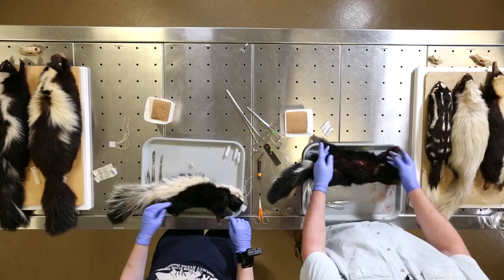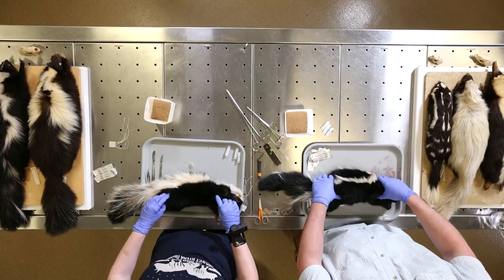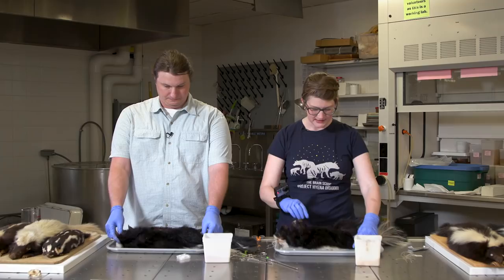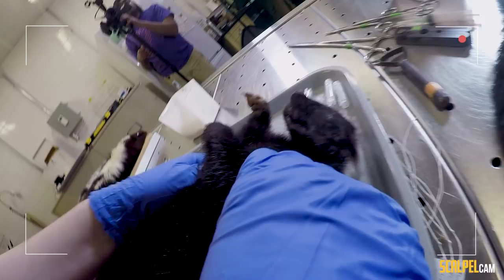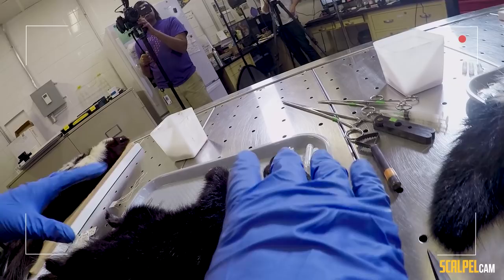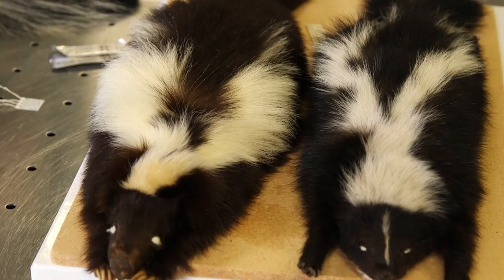Look how proud she is — this is a very large female. I've got a really emaciated male here; he's very skinny, also covered in lice, and he has a pussy foot. Our goal today is to turn them from specimens with all their gooey bits into study skins that can be used for research. The big trick is we don't cut the anal glands — if we do that, we're in the splash zone.